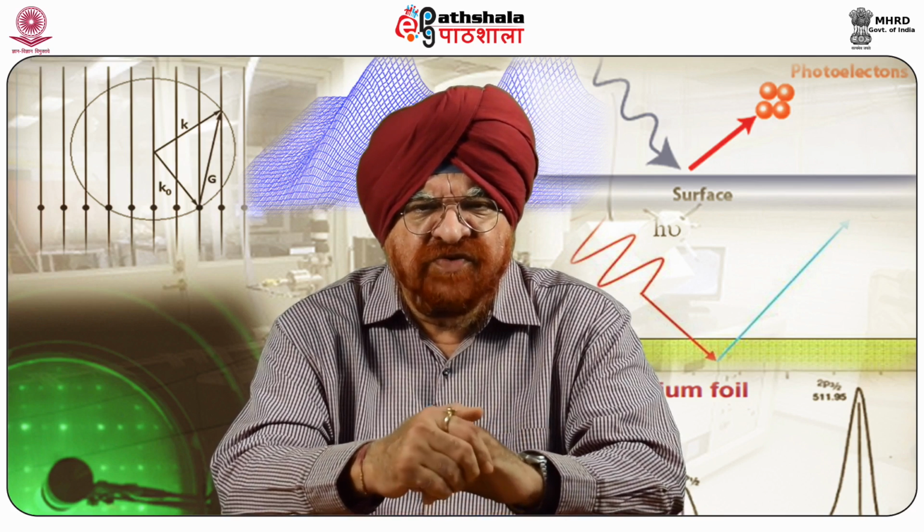Magnetic force microscopy involves basic principles and applications, and is important because of the long range nature of magnetic forces. You will find there are many techniques where it can be used.